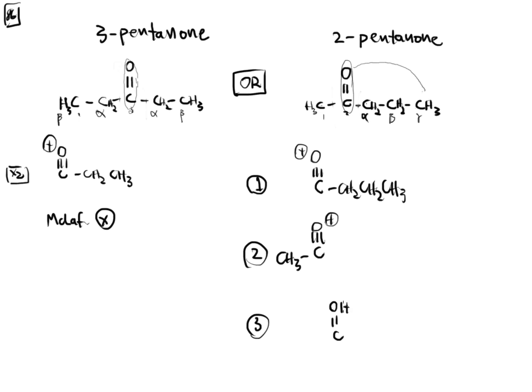So a hydrogen is going to be slapped onto that oxygen, which is what gives it that positive charge. In the meantime, it's going to take one of the electrons and shove them in here and create this 2-carbon alkene, and then this molecule gets chopped off at that location, and away this goes. So what we have left over is our CH2 group, and then over here is our CH3 group. All right, so here's my positive fragment. That is a McLafferty rearrangement, and that's what we saw in the PowerPoint slide just a second ago.